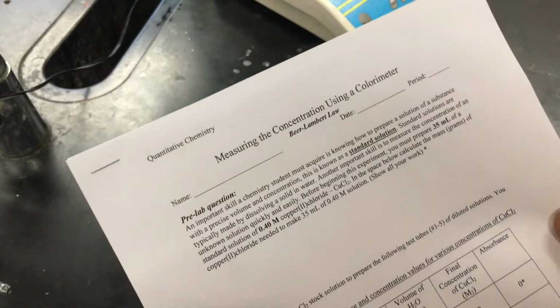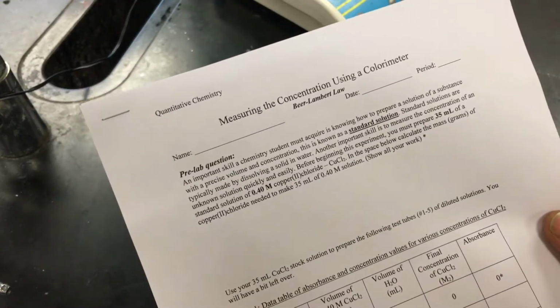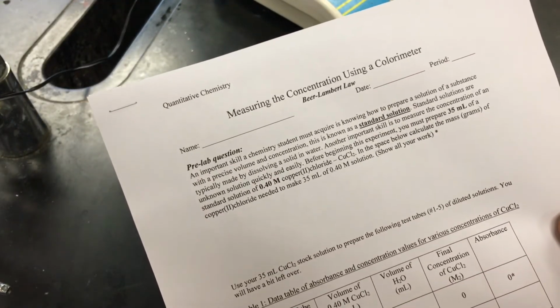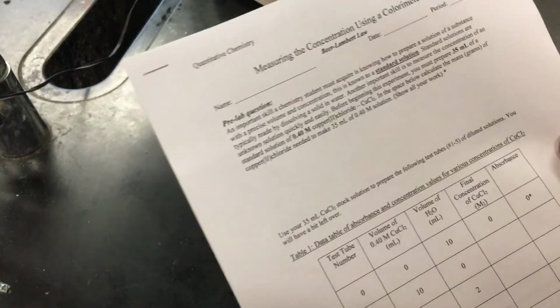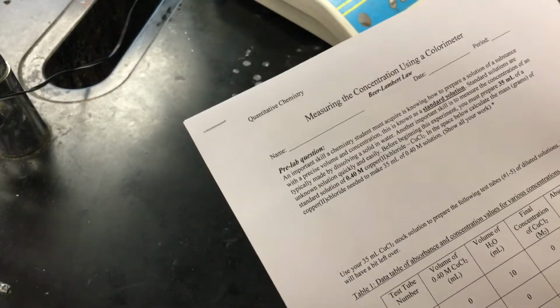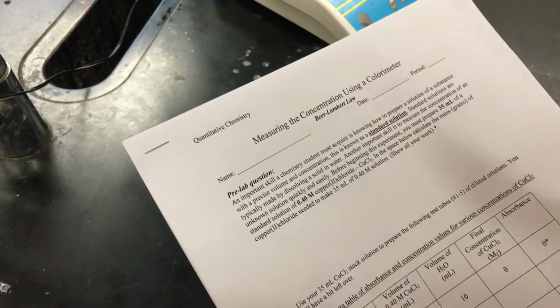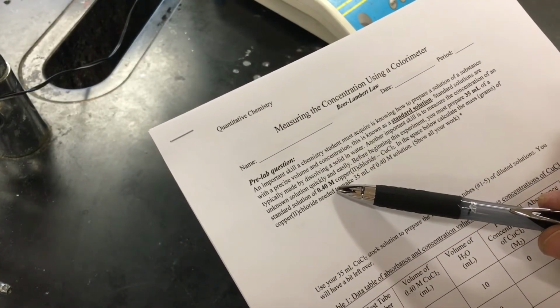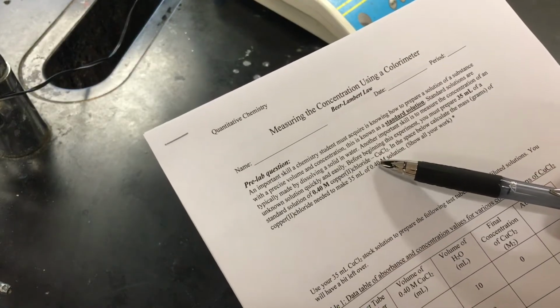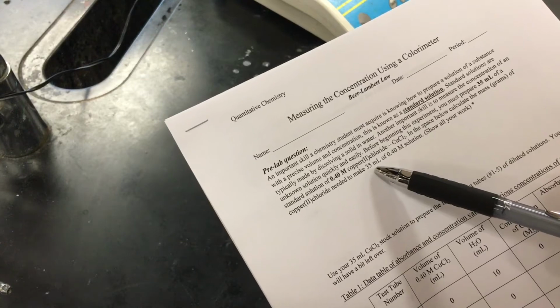Alright, this is our lab on measuring the concentration of an unknown, and we're going to use the Beer-Lambert law to do this. The first part of the lab is to calculate the amount of copper chloride that we need to weigh to make our stock solution. So the idea in the lab is to prepare a stock solution of 0.4 molar copper(II) chloride, and we're going to prepare 35 milliliters of that solution.